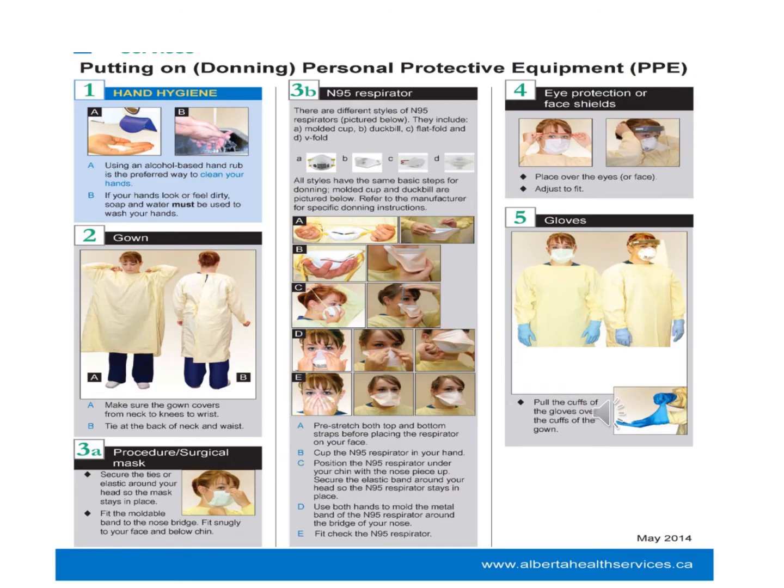In the next slide, we will see how different protective equipment has to be worn. In this slide, you can see that if you have to deal with this particular spillage, you have to put on personal protective equipment. There are different terminologies used for putting on or taking off personal protective equipment. For example, while you are putting on personal protective equipment, it is called donning.